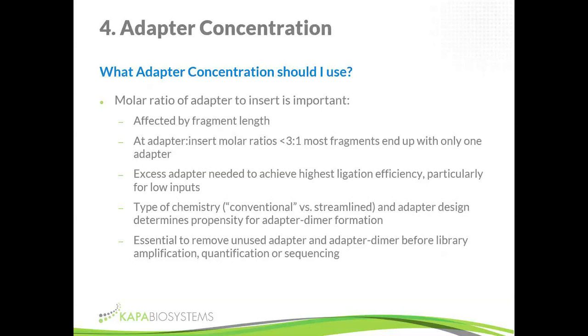But reducing the adapter concentration to the point where they don't form is not the right way of doing it, because you're reducing your library construction efficiency. The best strategy is to use a reasonable and the highest adapter insert molar ratio that your chemistry allows, but then do your cleanups properly.